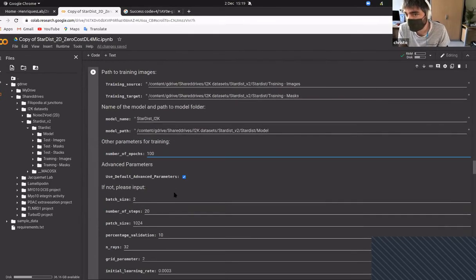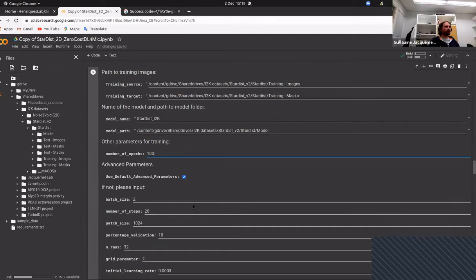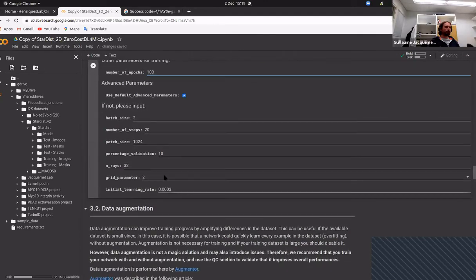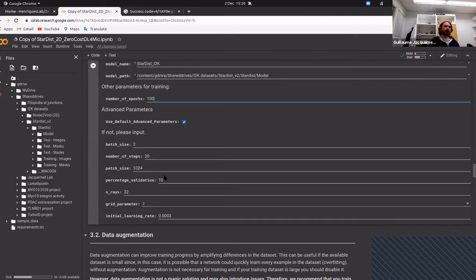And would it be possible when you run this module to be able to flick through the pairs? Because I see it only displays one pair, right? So sure. I'm not sure. I mean, if you have a problem, for example, like there's a missing image, what happens? If there's a missing image, you're going to get an error, basically. Before training starts. So if you have a missing image, or if one of the names is different, so let's say you have an extra space or something like this, which might happen, then you will also get an error before training.